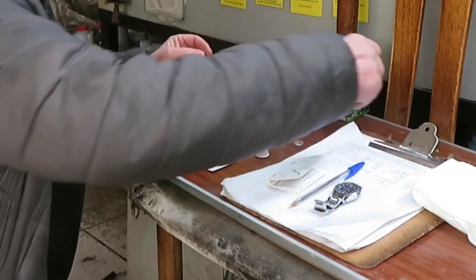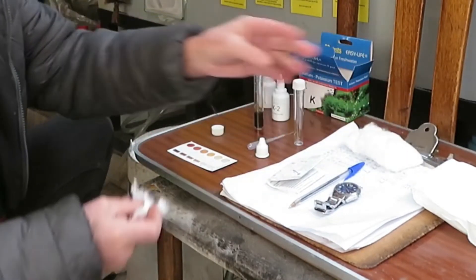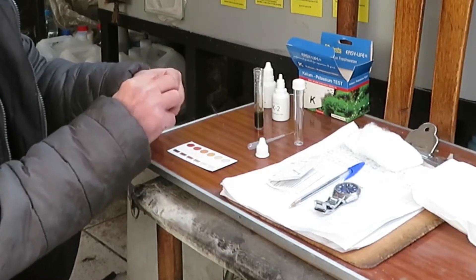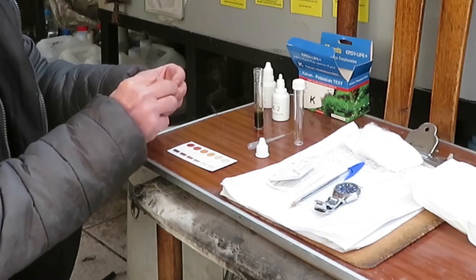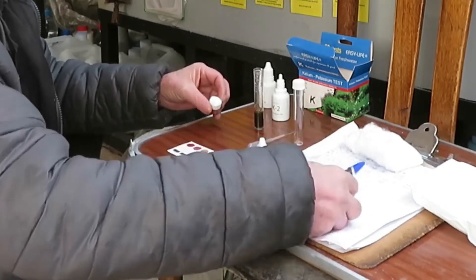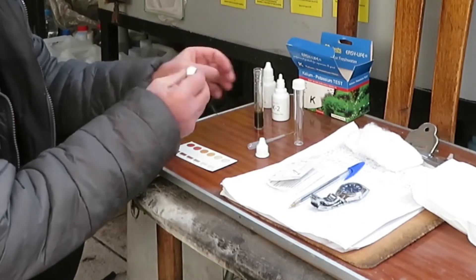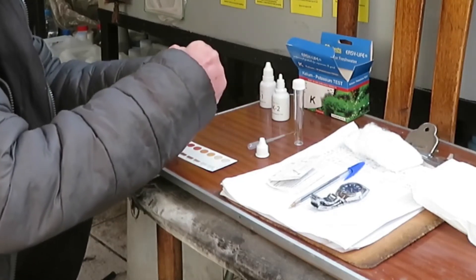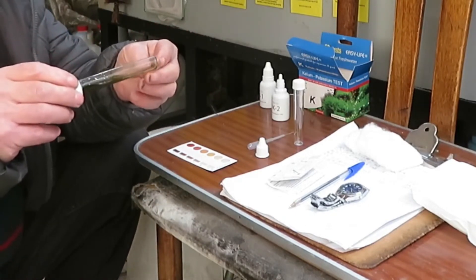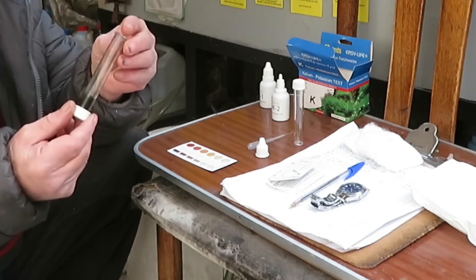Meanwhile, we get a bit of cotton wool and press it firmly into the top of the vial — but not too firmly — so it picks up as much of the liquid as possible. One minute has gone by, so we put the cap on and place the vial sideways so the liquid is absorbed as much as possible by the wool.